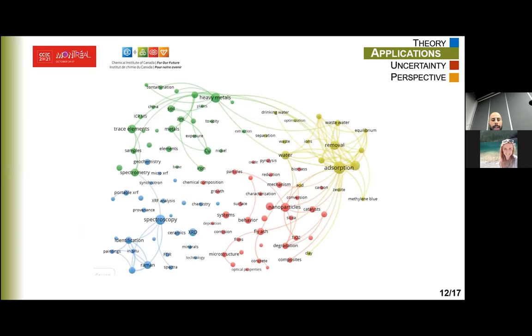So, the applications. X-ray fluorescence is not that used in analytical labs. It's not as common as GC or FTIR or other techniques. It's very used in industry, usually for quality controls and things like that. As you can see, it's used everywhere, especially with metals, usually alongside absorption spectrometry. It doesn't have a specific field; you can use it everywhere you want to check your elemental composition.